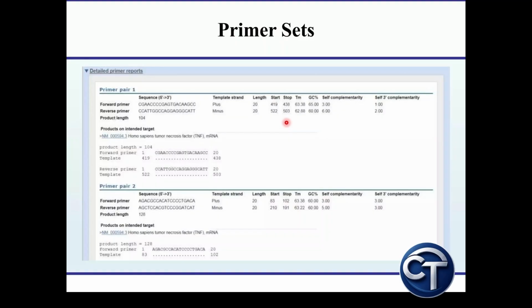So if I conclude, in silico primer designing is a powerful integration of bioinformatics and molecular biology. It allows us to design precise and efficient primers, reducing failure rates and improving experimental outcomes. Understanding both theoretical principles and practical tools is essential for every molecular biologist.